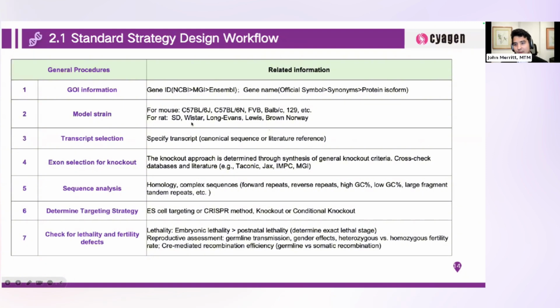What's in the market right now? What are people interested in studying? What are the rare diseases that folks are trying to make gains on? We first find genes in the literature that are relevant to scientists, and then we look up the gene on NCBI, MGI, and Ensembl to figure out what's already known and what's already done, because we don't want to make a mouse model that already exists.